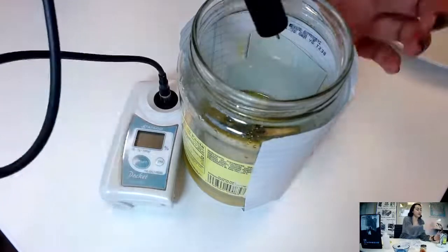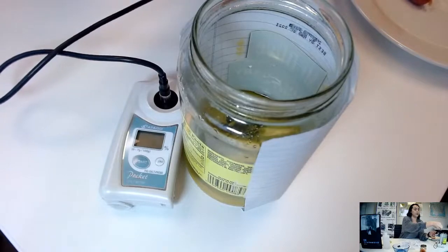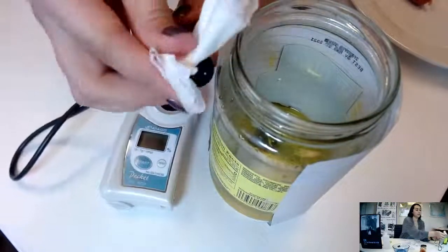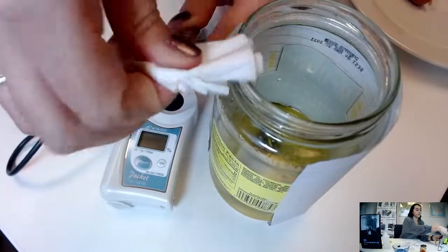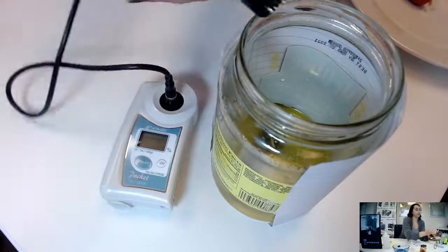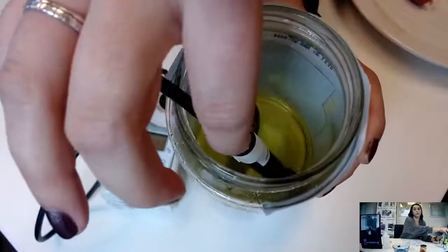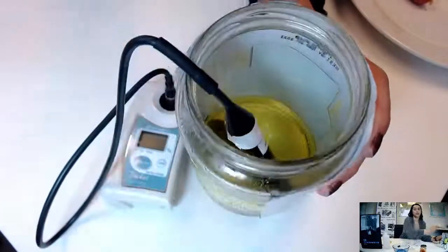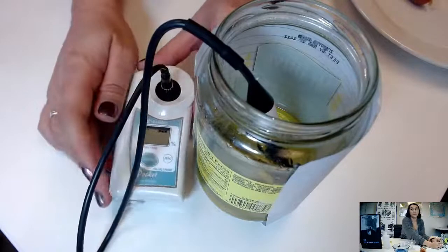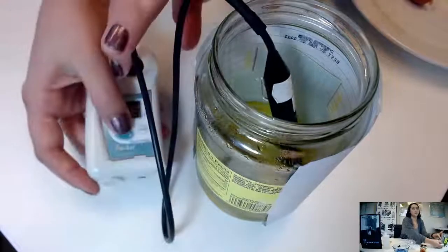All right, so we have let that submerge for a second. We're just going to take this and wipe it off, just like that. Okay. We're going to place it back into the brine or the pickle solution like that, and turn it on. Great, and we'll press the start button.